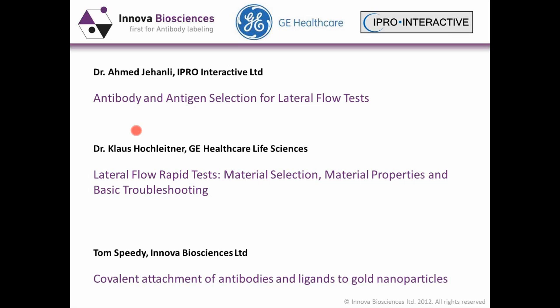Tom, our Corporate Business Manager from Innova Biosciences, will introduce you to the covalent attachment of antibodies and ligands to gold nanoparticles. Innova Biosciences specializes in bioconjugation technologies.